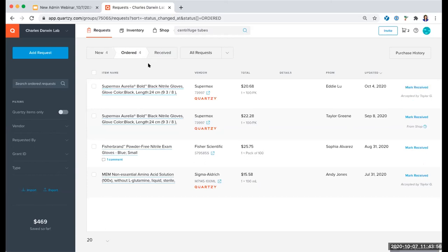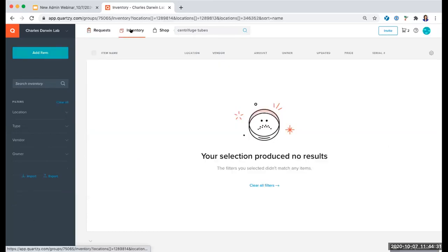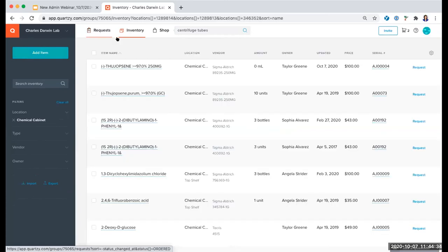A question came in: is there a limit to how many people can access the inventory or request materials? There is not — you can add as many members and promote as many administrators as you like. Regarding the question about exporting and importing spreadsheets: you can do it in both the request and inventory modules, but the inventory is sometimes a more common place. You have two buttons: the Export button and the Import button. Importing will give you the option to download Quartsy's Excel import template, where you could copy and paste all of your item details if you're keeping track in Google Sheets or an existing Excel spreadsheet.